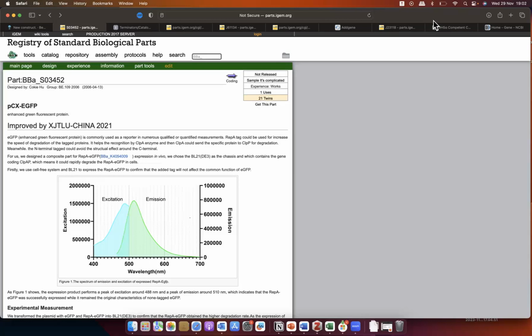What we mostly use now are assemblies of the type of Golden Gate. They use type 2S enzymes, which means that they recognize the sequence, but then they don't cut inside the sequence, they cut outside, just in front of it. And then you can change those 3-4 base pairs that they cut with whatever syntax you want, and so you can stick them in 1,000 different ways, because you can change it with any letter or any sequence you want.